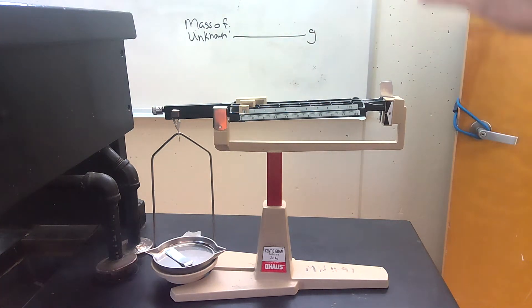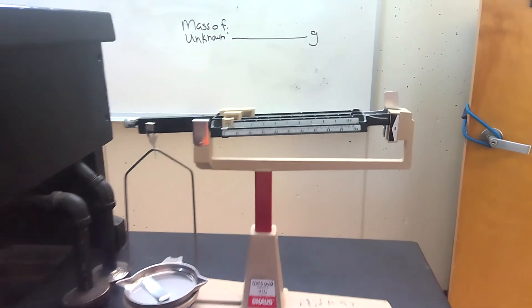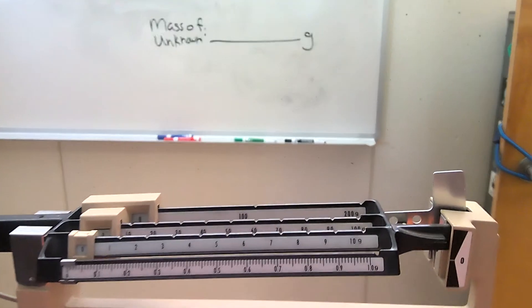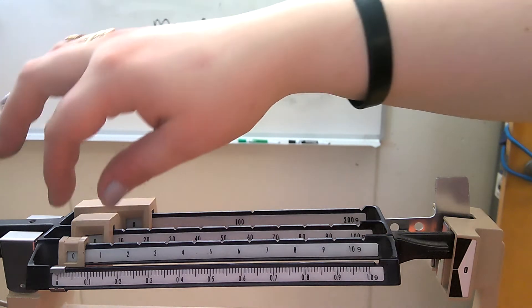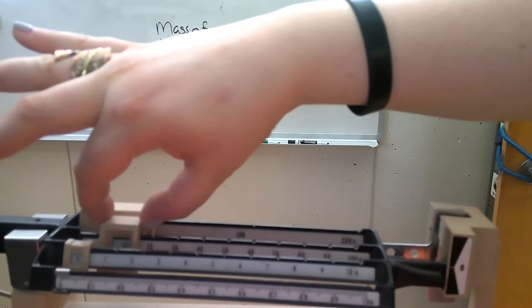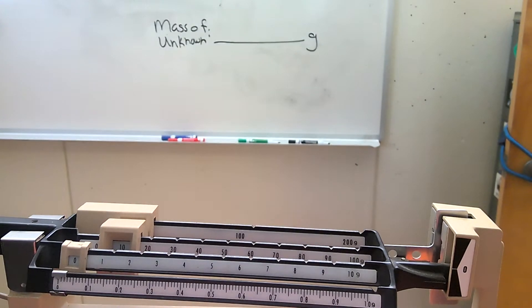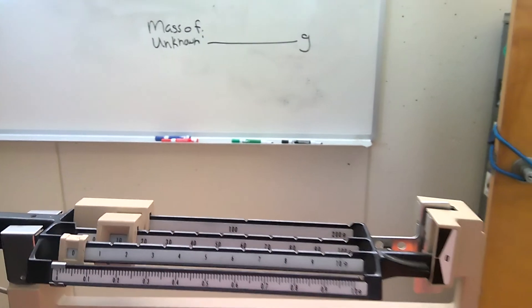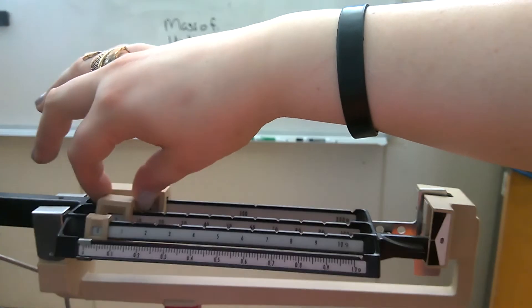So obviously we can tell that that metal, it's probably not anywhere near the hundreds, so we're going to leave the back rider alone. I'm going to move in just a little bit so you guys can see. So I'm going to move the tens to the 10 window. Our arrow went down, which means that this is not anywhere near 10. So we're going to move it back to zero.